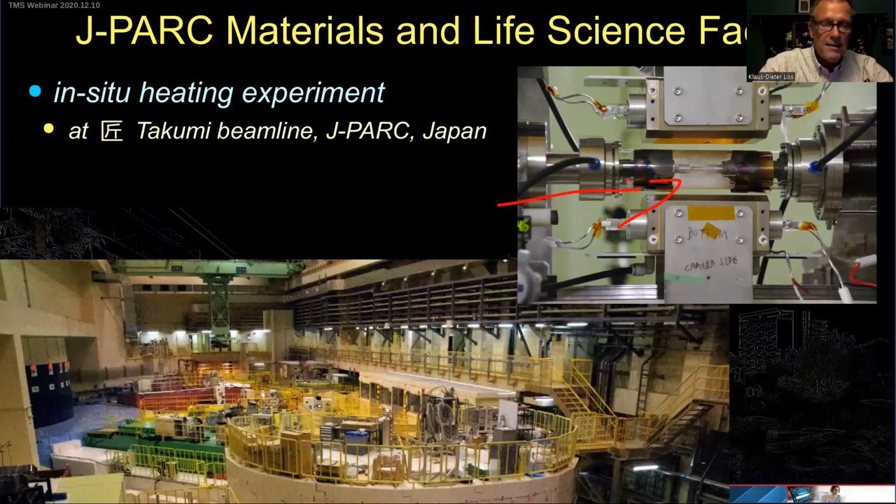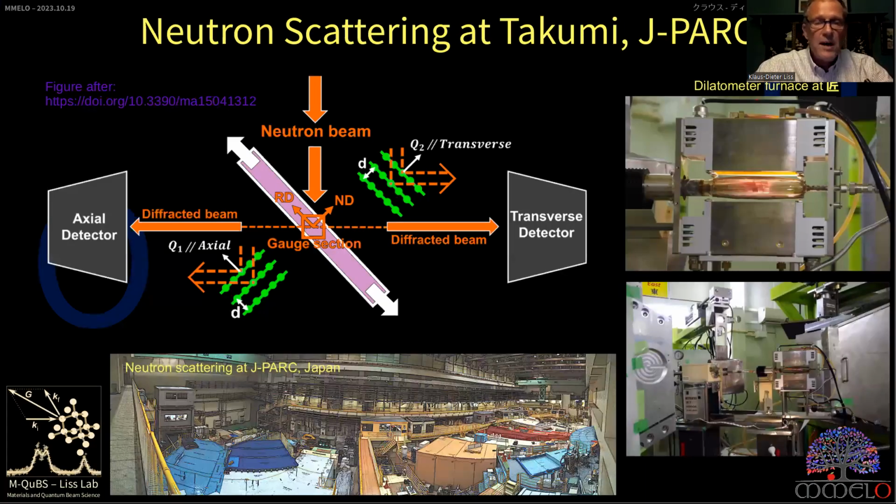The beamlines there, many of you probably have seen beamlines. There's a source here, and there are beams coming out of this source, and the hut and experimental setup is called a beamline. What they have there is a heated load frame or a dilatometer. Here to the right is a dilatometer furnace, which I have used.